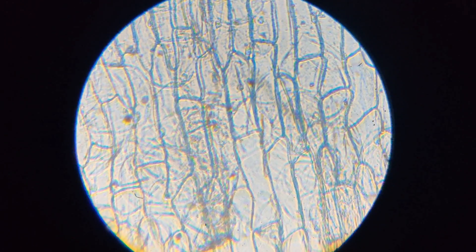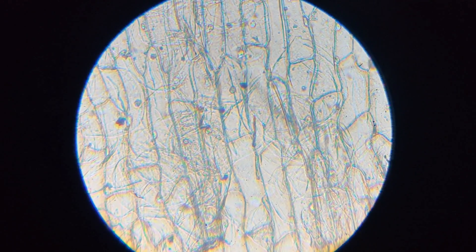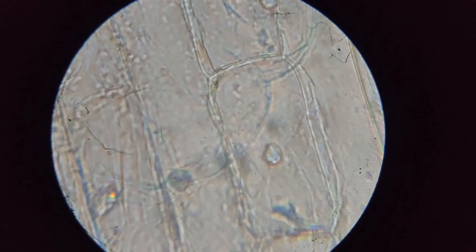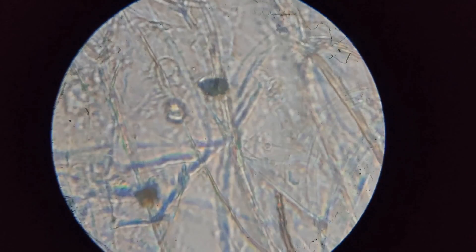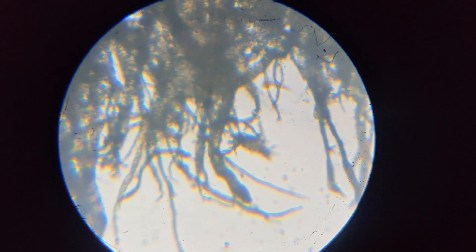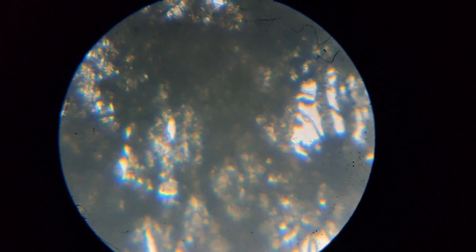This is the onion cells. Yes, this is the onion cells with 100x zoom and 450x zoom. Can you tell this? This is a tiny piece of tissue paper.